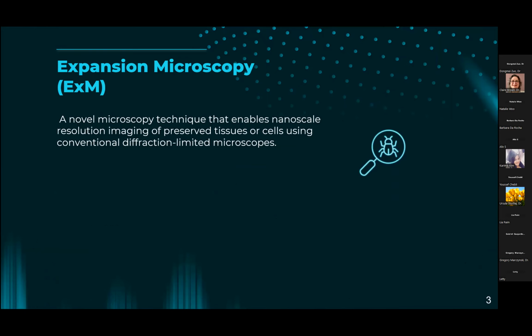The way that I like to explain this to people who may not understand what that means is, let's say I have this sample and this bug is what I want to study. We can see it, but we want to look more deeply into the proteins, and the interactions that happen within this bug. And that's where we employ a microscope. There are so many different microscopes out there, and so many different techniques.